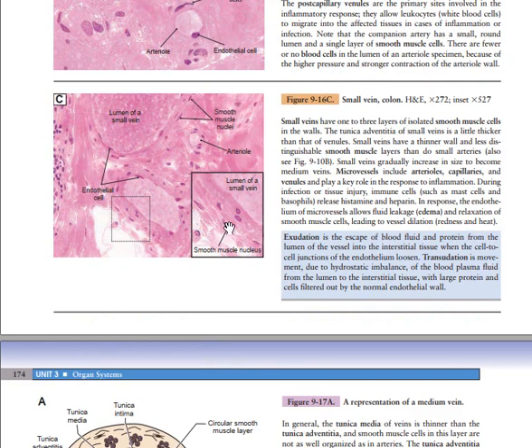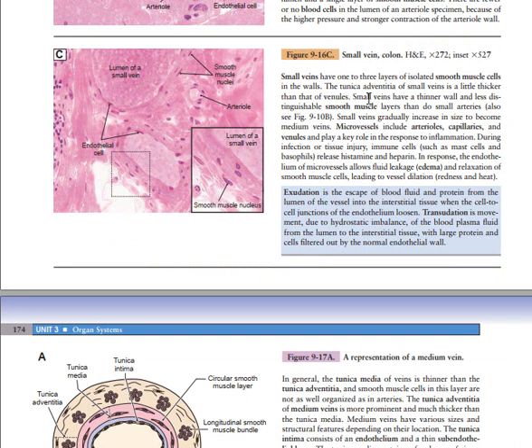As you can visualize here, this is still another section of a small vein, stained with hematoxylin. Here you're going to have one cell layer of endothelial layer, then another cell layer with a smooth muscle cell layer, and then you have the connective tissue layer around it. So we have one cell layer of the endothelium, then a smooth muscle cell layer, and then a connective tissue layer.